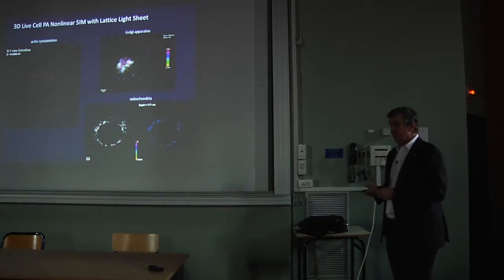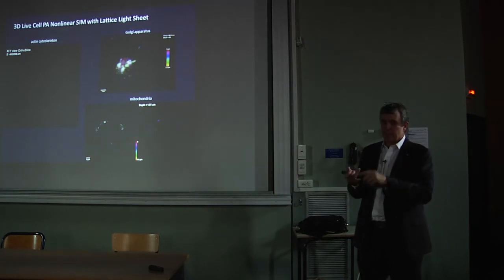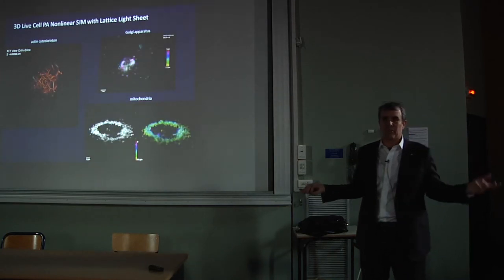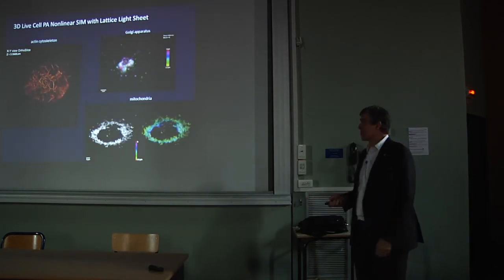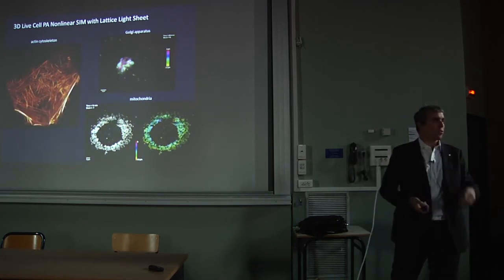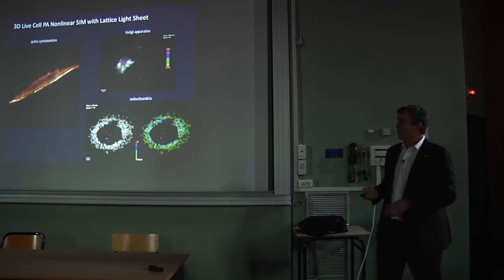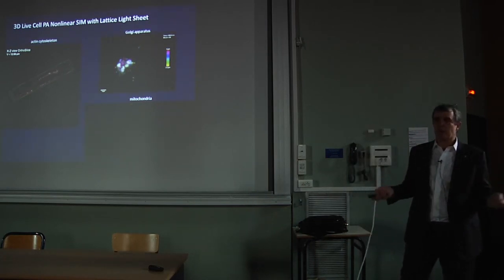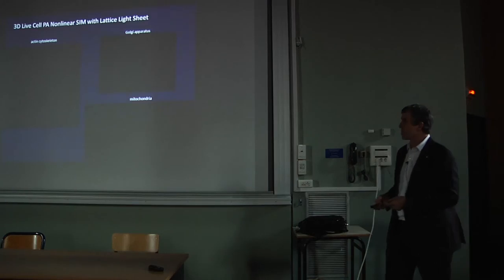But really this technique is very difficult to do because it takes 20 to 30 seconds minimum to get an image versus sub-second in the two-dimensional case. And of course you're throwing much more light at the specimen in order to work your way through the whole thing. So whether this has any real legs for biology, I'm not sure. We did it primarily as just a demonstration.